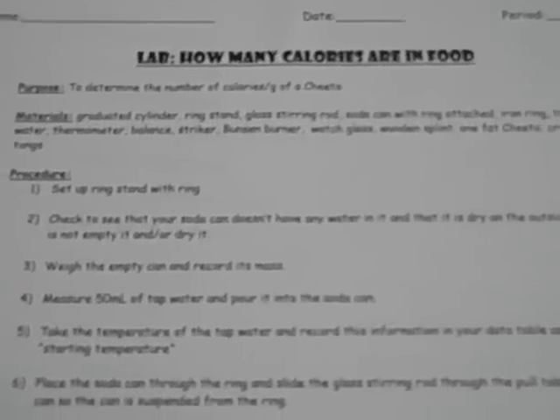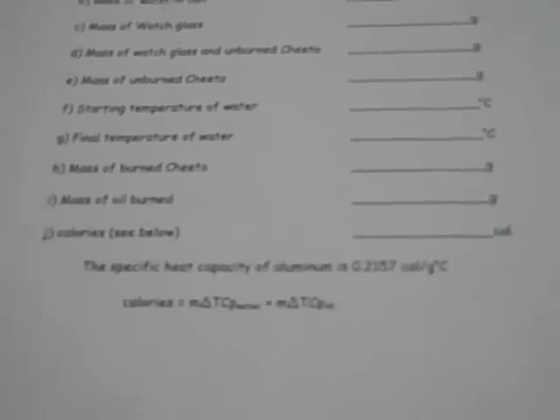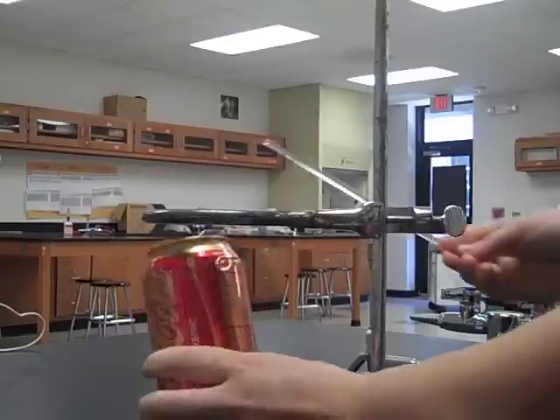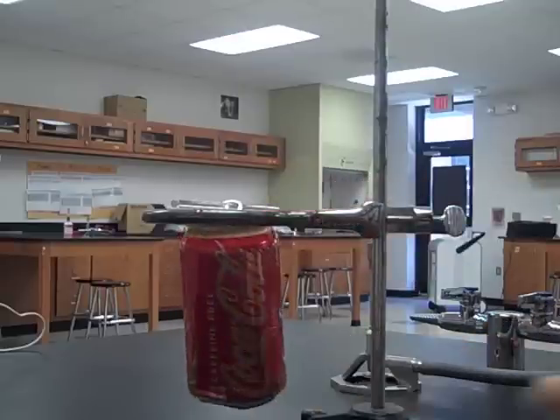Set the ring stand where the ring is about eight inches from the table — you can see that here. Record data A through F on your data table. This is how you're going to place the soda can on the ring stand for step six. Make sure to hold the Cheeto with crucible tongs.